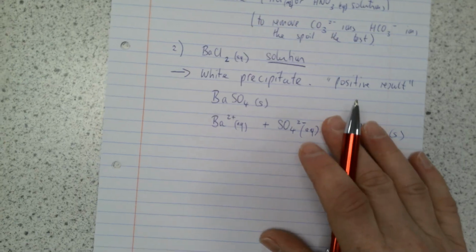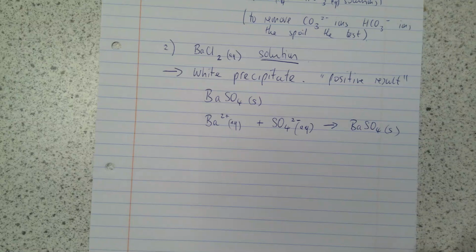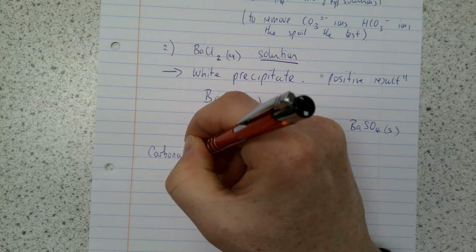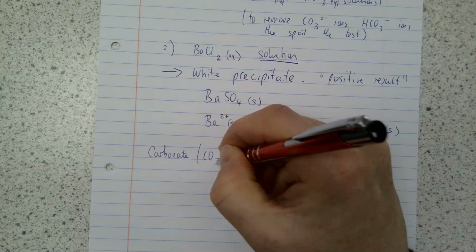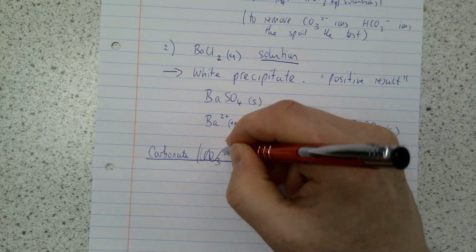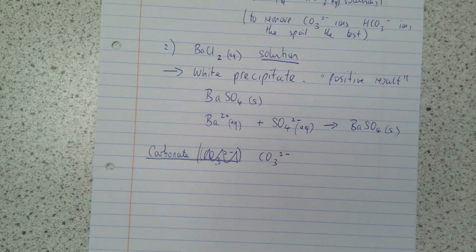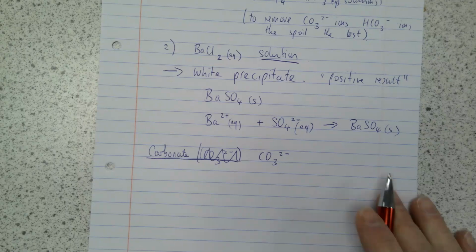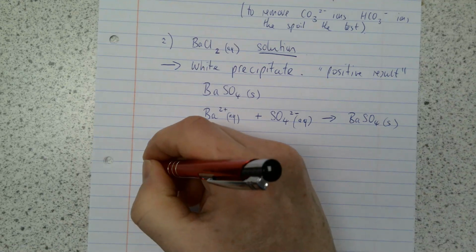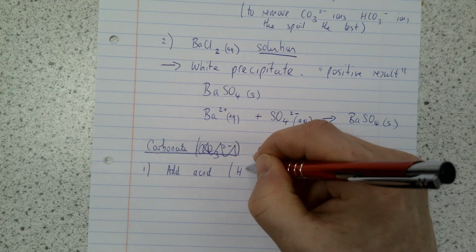The other test we've just done is the test for carbonate ions, which is very straightforward. This is probably the easiest one to remember. Again, you need to know the formula of carbonate ions. So it might be sodium carbonate, it might be magnesium carbonate, whatever, but it's carbonate ions. It's CO3, 3 oxygens, and it's overall a 2- charge. So what you do for that is simply add an acid, typically hydrochloric acid.